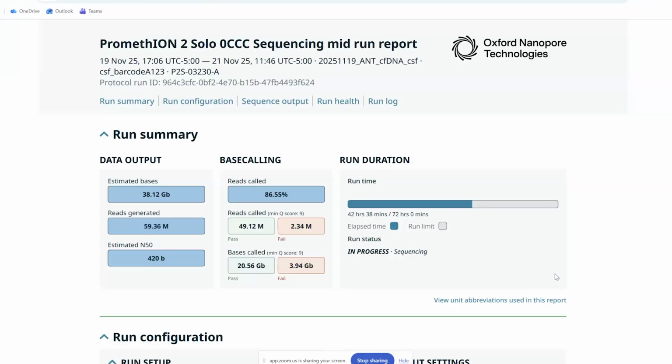I see. And I guess a question on the POD5 and FASTQ packaging: we've been doing it by the hour, so we have just a bunch of stacked files. I noticed that EPI2ME has a tool for concatenating all of the FASTQ files. Is that something that needs to be done before running any of the other workflows, or can I just feed it the folder directory? You can feed it the folder. It's FastCat, I think, is the program that we have.